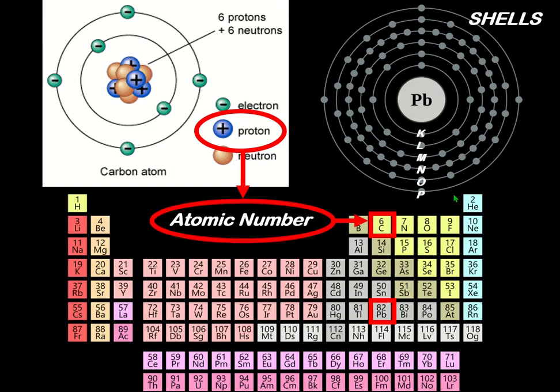And so, you know, here you can see the atomic number is high, so a lead rather, or here is tin. So here's tin. Now that would have been better to show you, wouldn't it? Tin. So tin is quite high, and higher than all of the other things like silica. Here's silica, which is what the quartz was made of mostly.